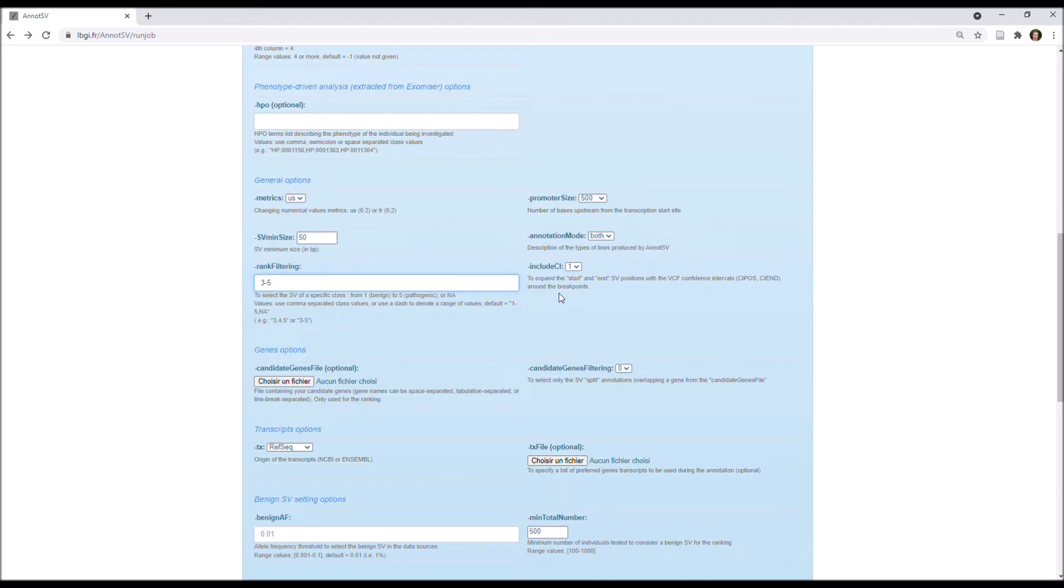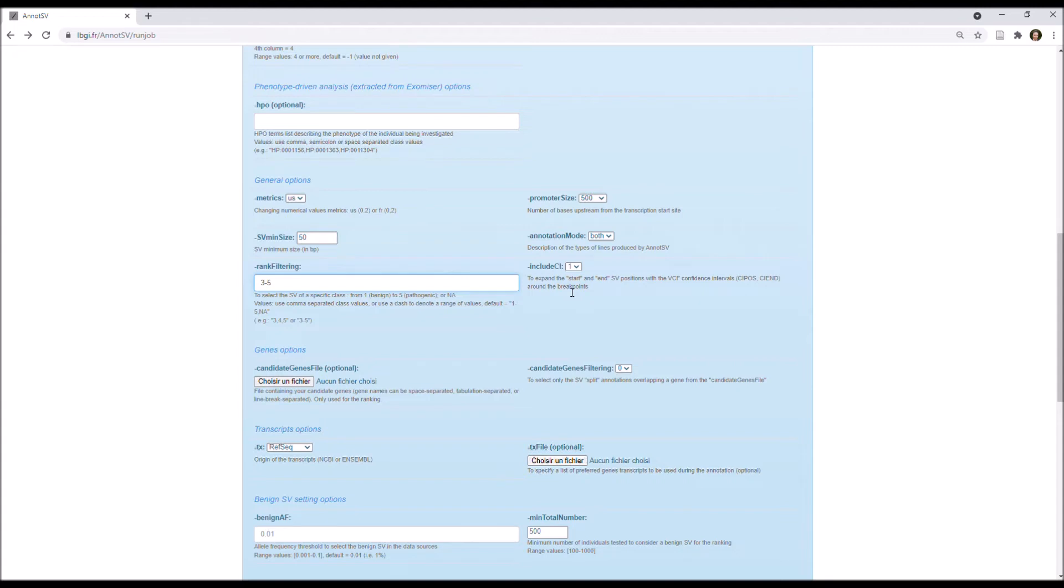So, if you use a VCF as input, and if you don't want to expand the start and end SV positions with the VCF confidence intervals around the breakpoint, you need to set this option to 0. This will allow you to keep the SV coordinates from your input file.